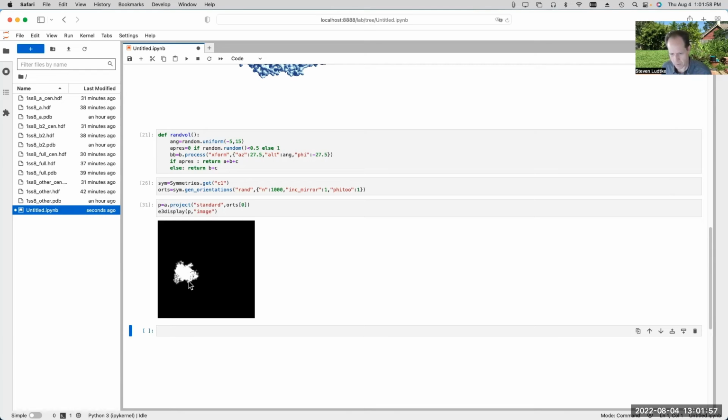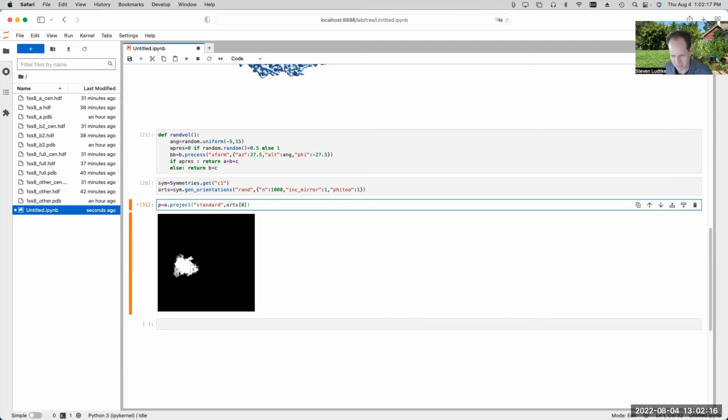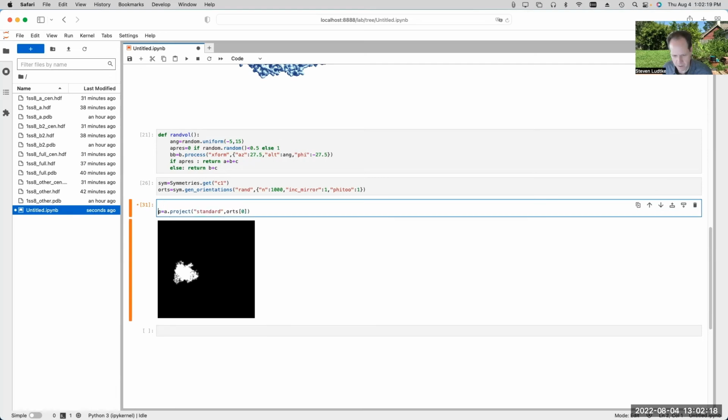Okay, so there's our projection in a random orientation of just that one subunit A. Feel free to speak up and ask questions if anything I'm doing seems funny or confusing or anything like that. I realize I'm going through a lot of this stuff kind of fast.